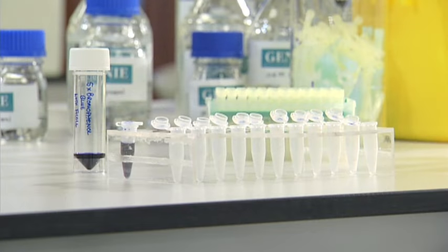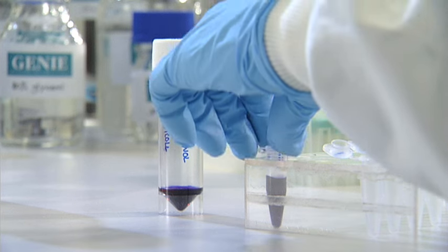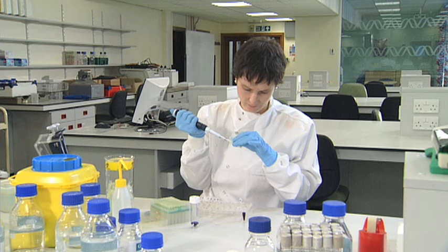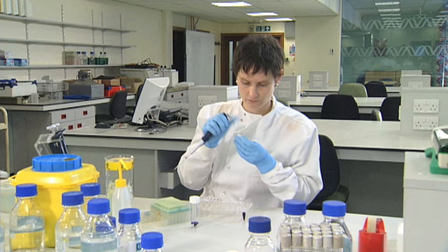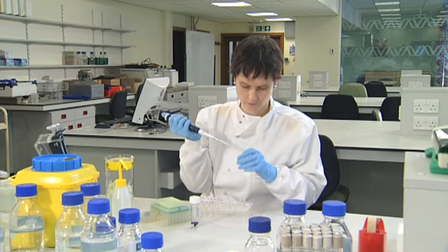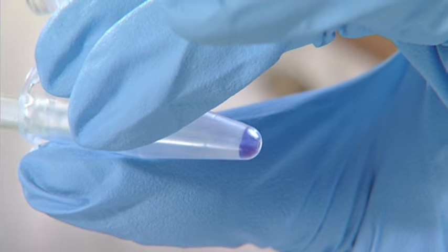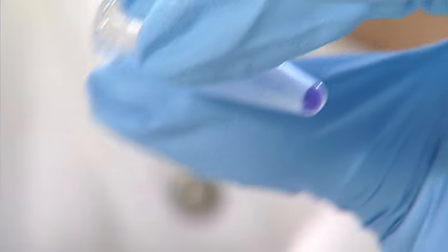Before loading nucleic acids into the wells, you need to add coloured loading buffer to the samples. One commonly used dye for this purpose is bromophenol blue. The loading buffer is made up of dye and a glycerol or ficoll solution. The dye colour helps to visualise the loading of samples into the wells and helps keep track of the migrating samples. The glycerol or ficoll makes the samples heavy so they sink to the bottoms of the wells.